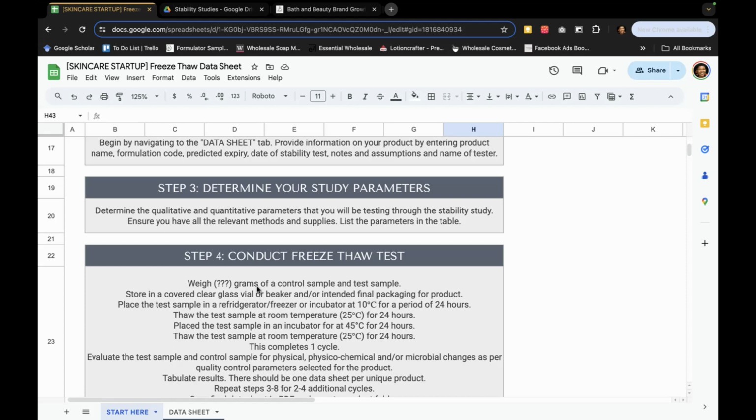These are the guidelines that we use in our lab, so that you can create your own set of guidelines, and it will help you if you're new to this to at least test your own internal methodology so that you can come up with a final method. So the very first step is to determine what study parameters you're going to be monitoring to assess stability.